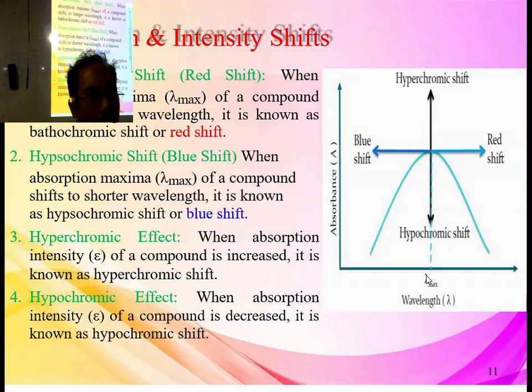Of the two, one is standard, another is unknown. You have certain standard peaks which are available on the internet. Now you get some unknown solution, scan it, take the plot and compare with the available data on the internet, and we can guess what type of compound is possibly present.